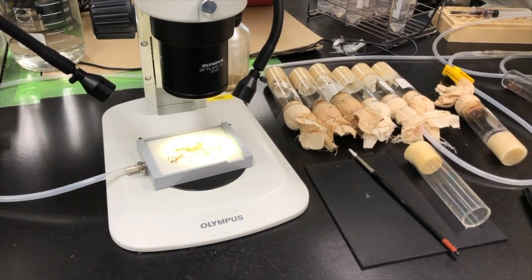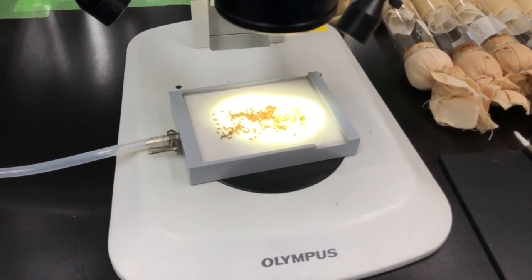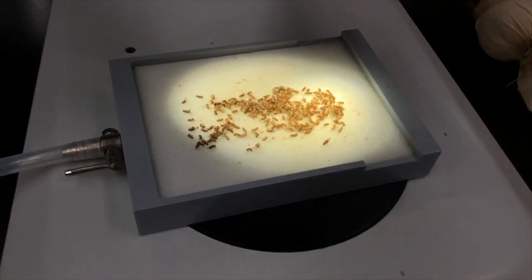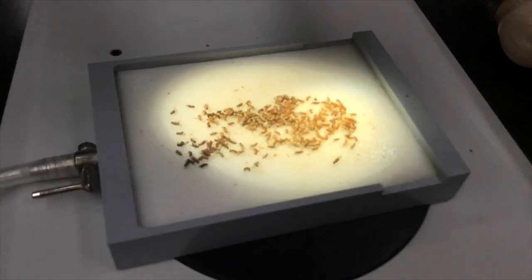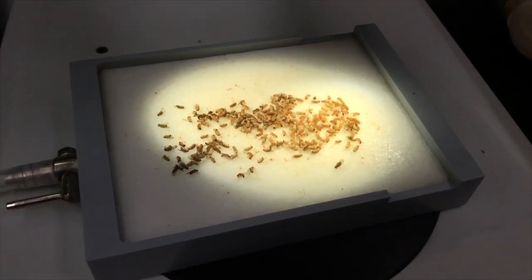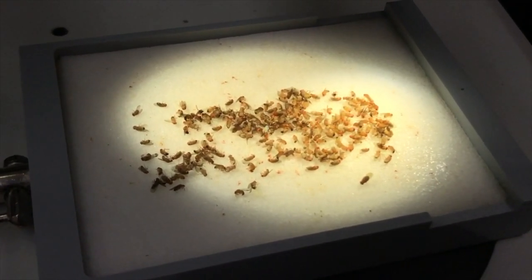After collecting them, we usually anesthetize the flies with carbon dioxide and observe them under a microscope to check species and establish strains for experiments. Net sweeping is a relatively simple method for those who want to collect and observe flies.